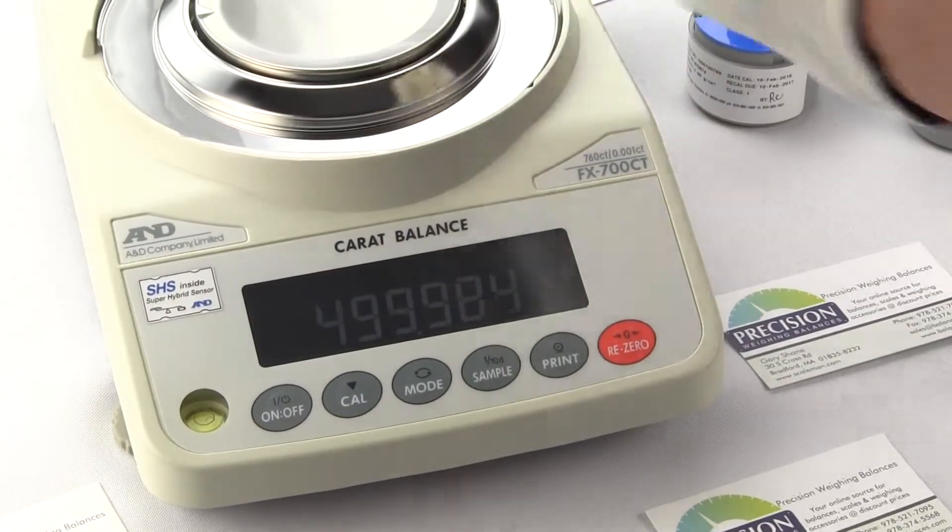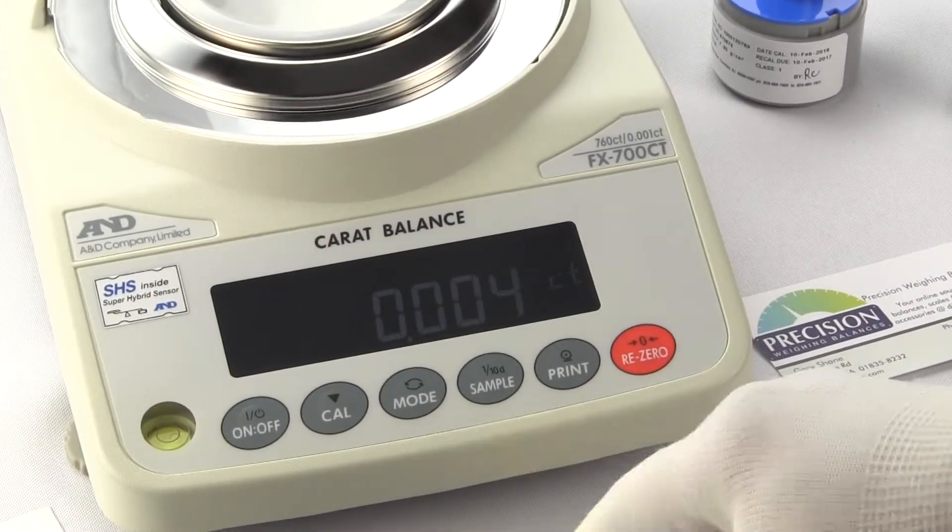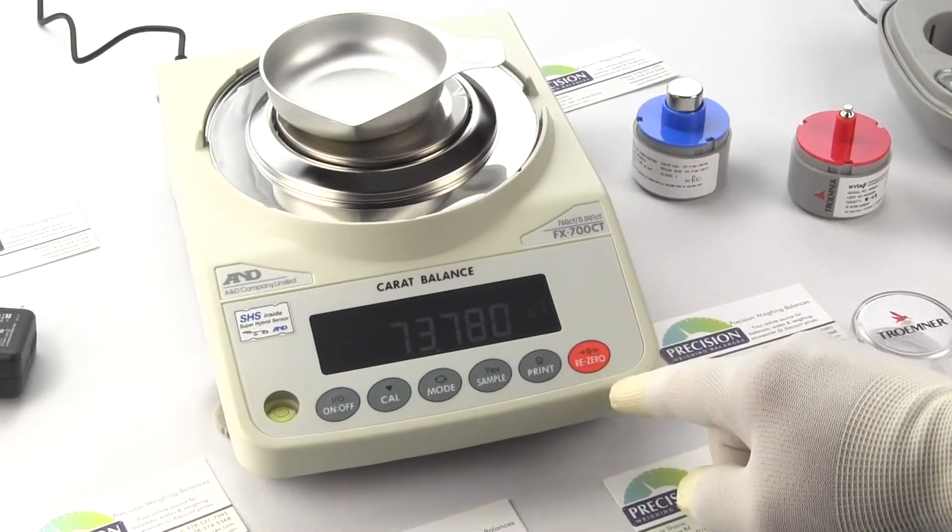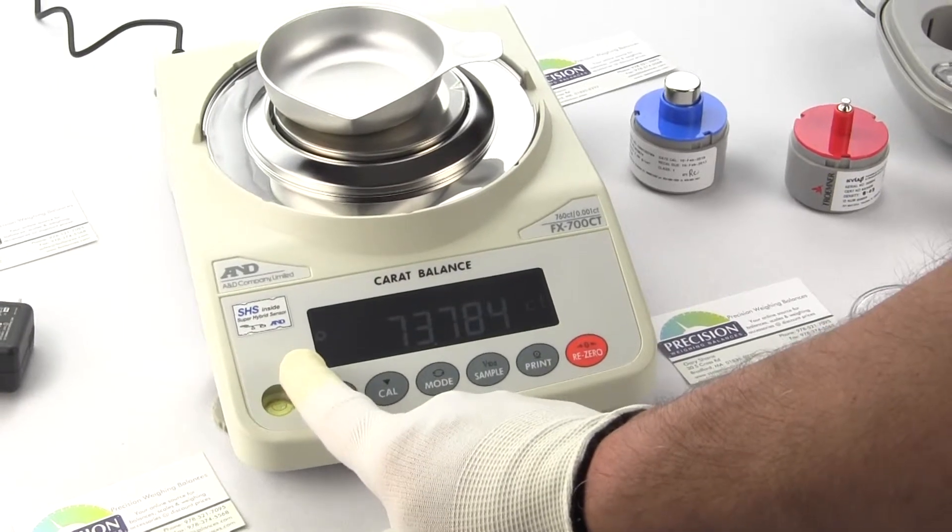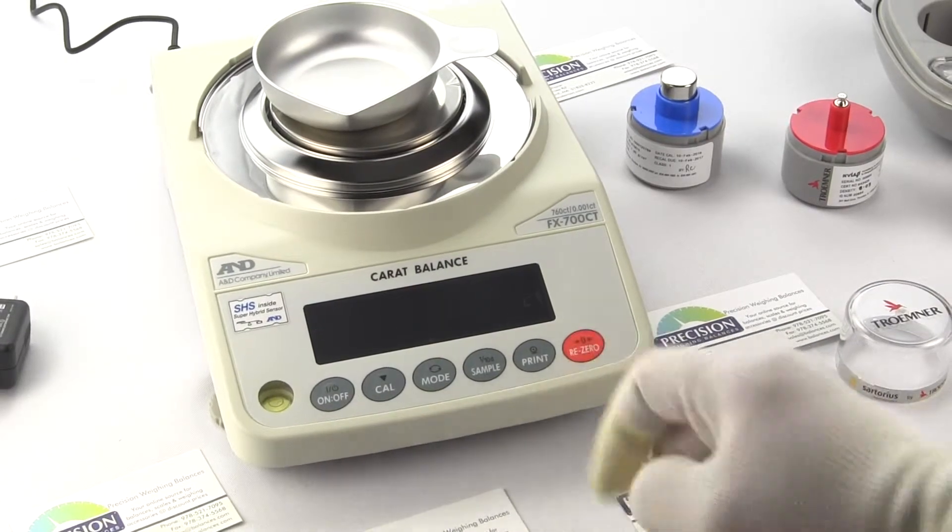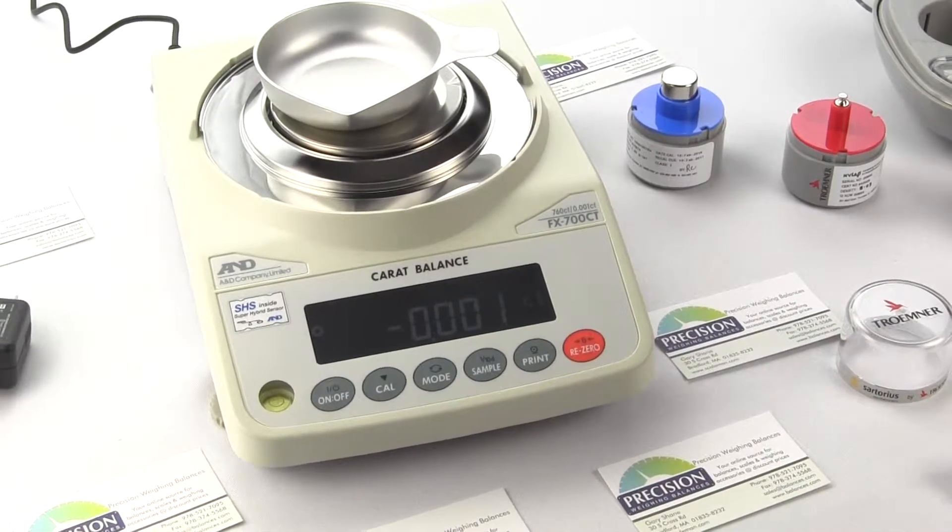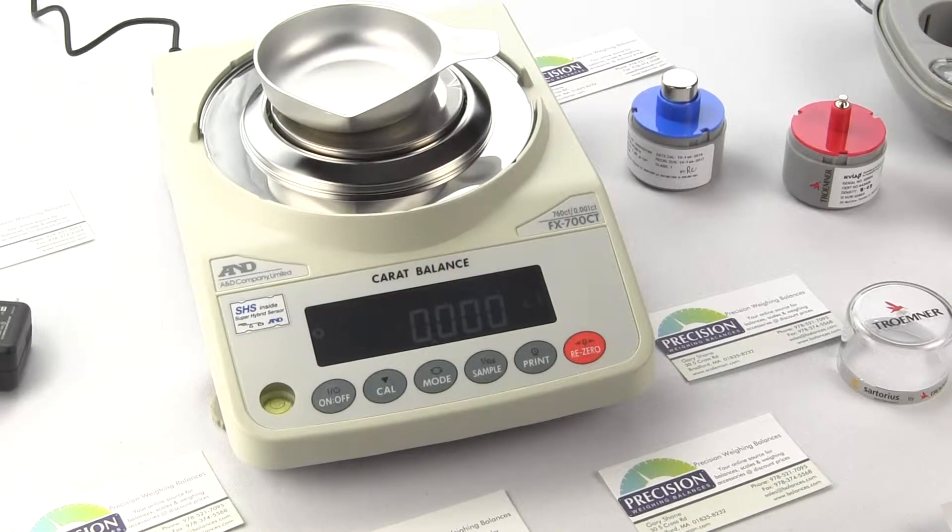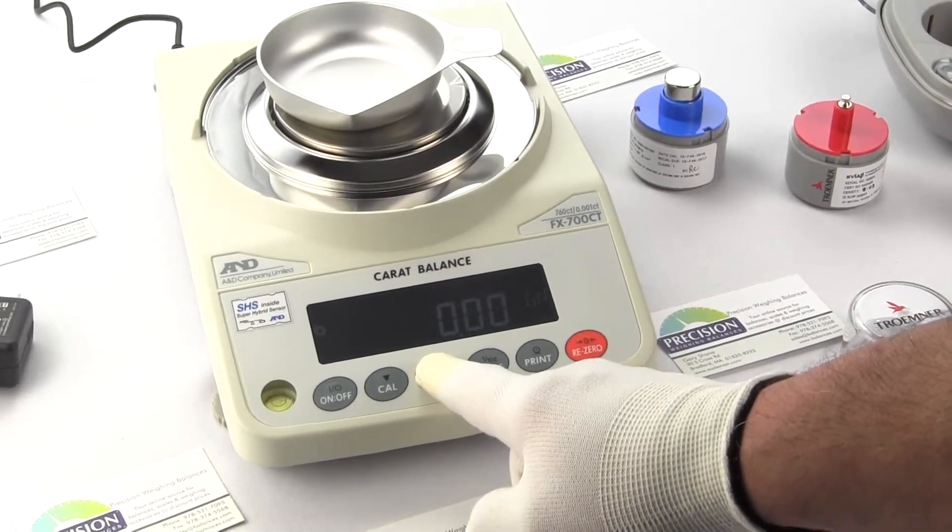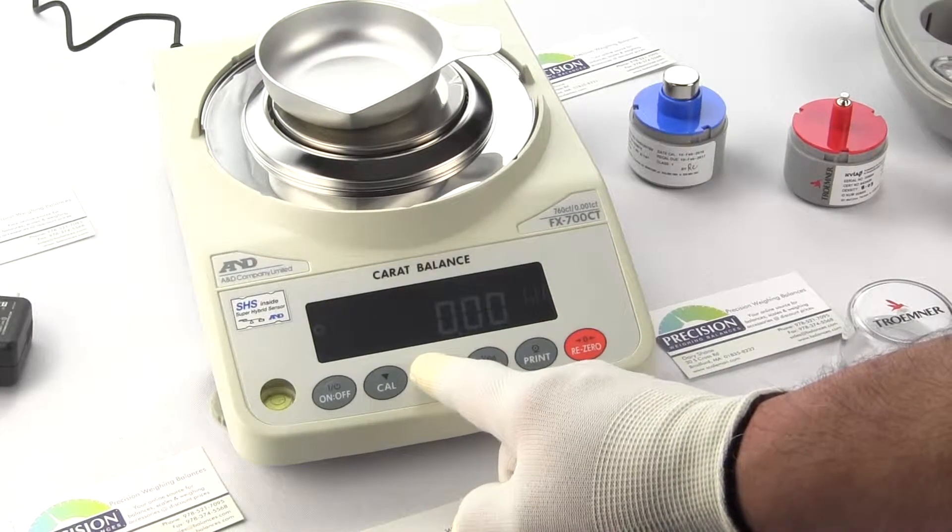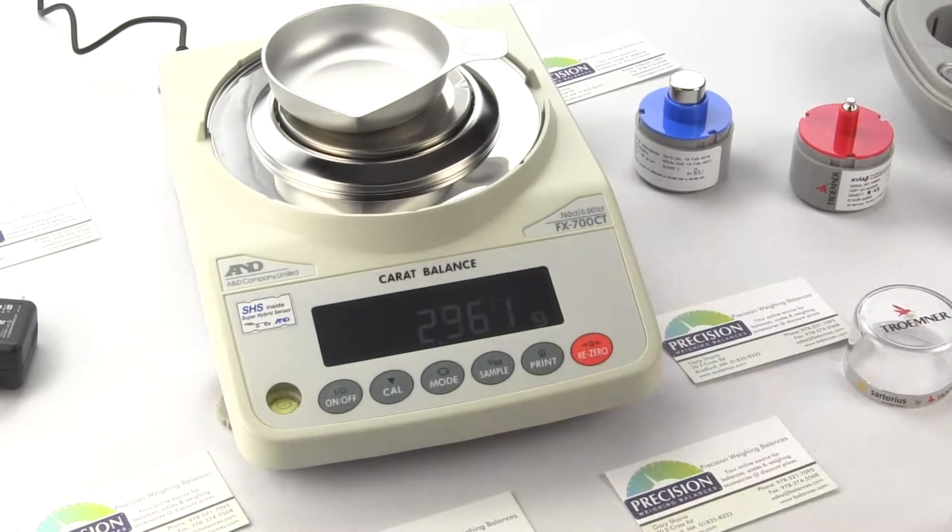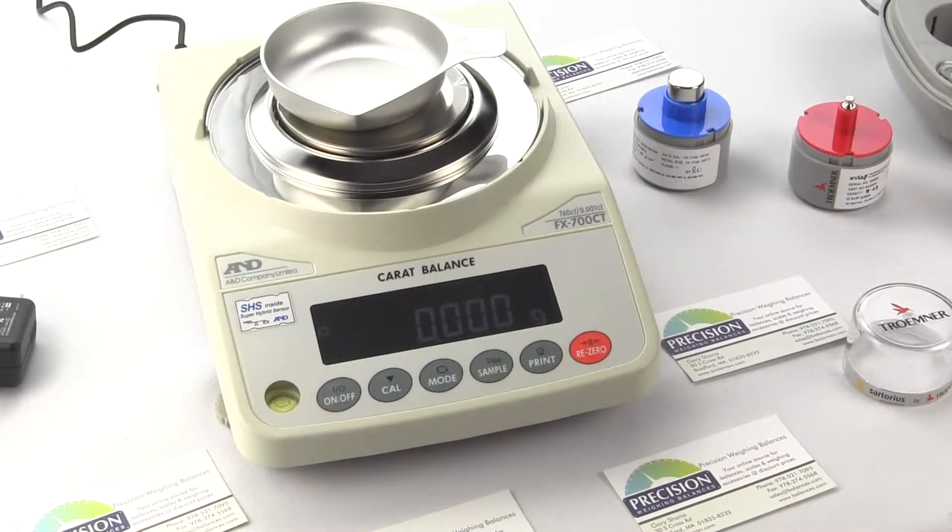So again the balance comes with these two gem trays you could easily put on a tray and once it's stabilized in the upper left hand corner here you'll see the circle which means it's a stable reading and you could tare it out. Laboratories and science classrooms or even quality control departments looking for a nice milligram balance. So again we're in carats we can just scroll through and be in grams so you'll see that this balance does increment in 0.001 gram which is a milligram.